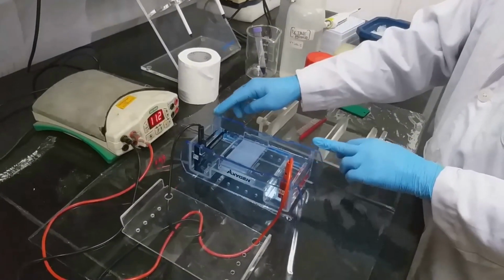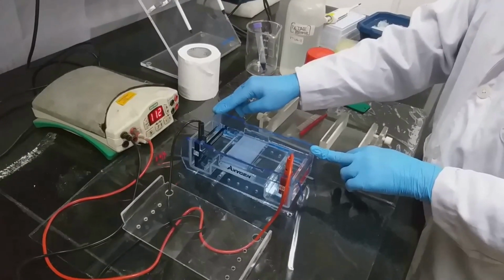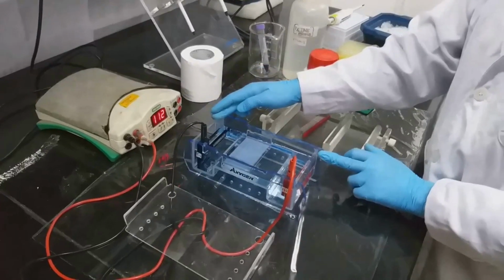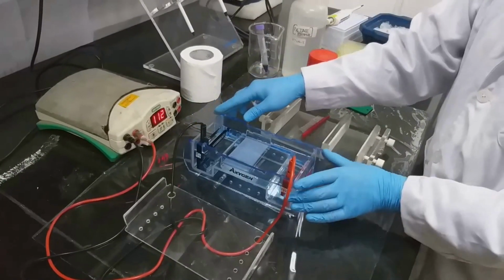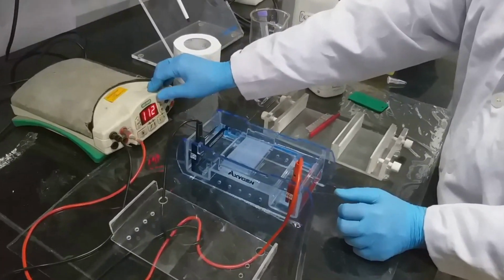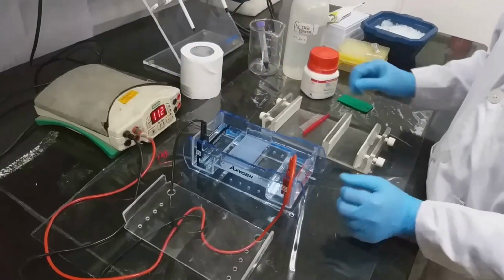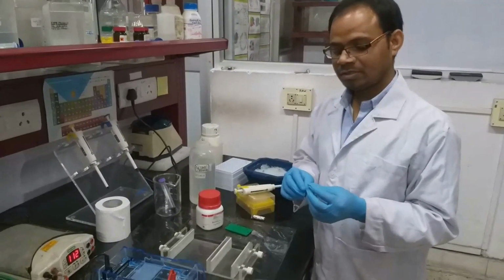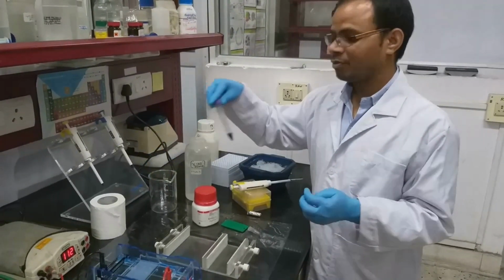Generally for analyzing the DNA samples we will use agarose gel electrophoresis. This is the power pack and this is the electrophoretic apparatus. This is a negative electrode and this is a positive electrode. We can change the voltage from here. For loading the sample, we have to mix the PCR reaction mixture with 5x loading dye.